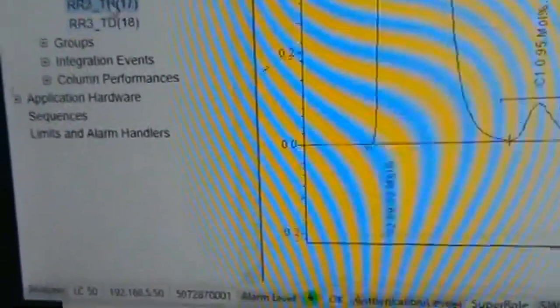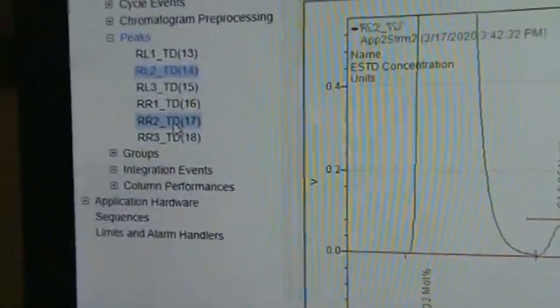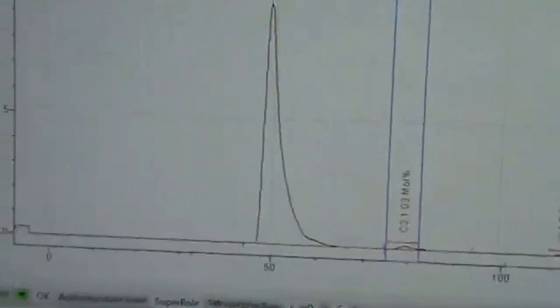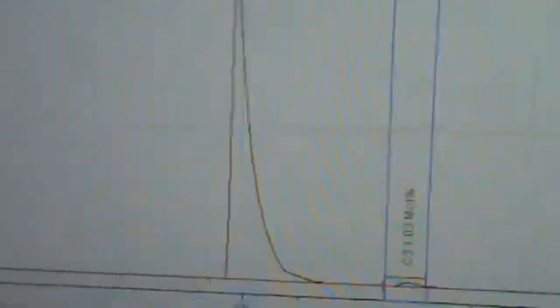That's pretty. Everybody's being measured. Everybody's pretty. That is the main detector for our R2. And that's all the lights that we're letting through as one big peak, not even trying to slow them down, let them go. And then we start getting our C3, C4s, C5s, and then we back flush C6. So here we go. Zoom.